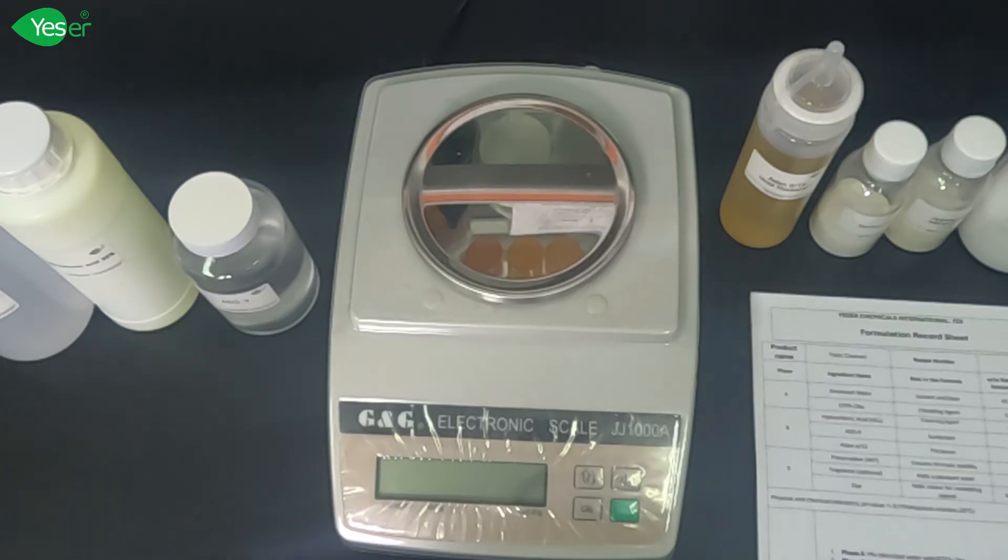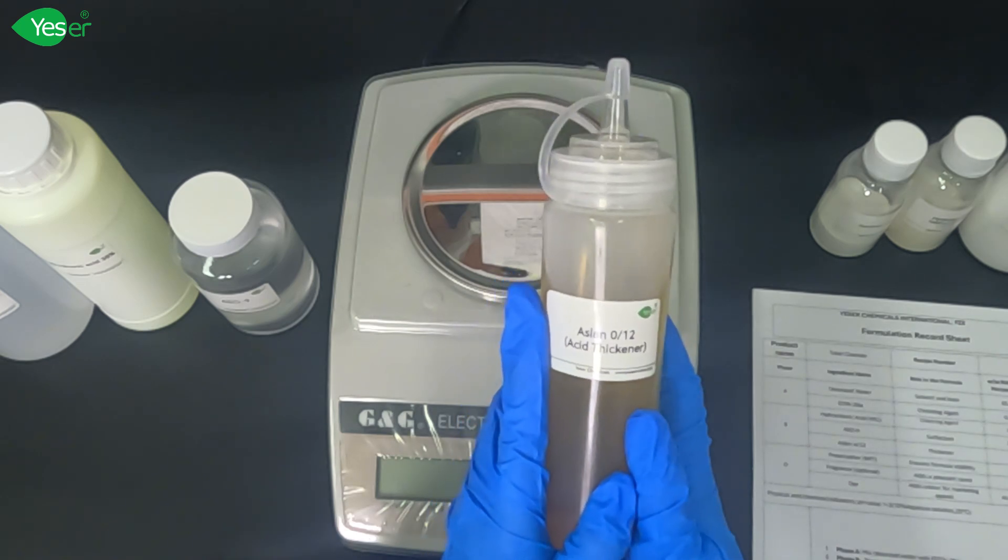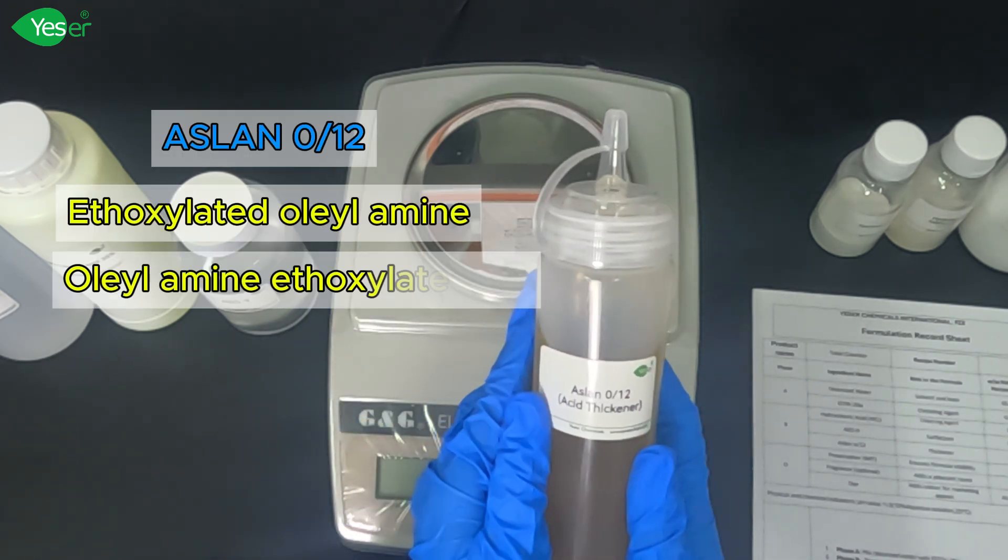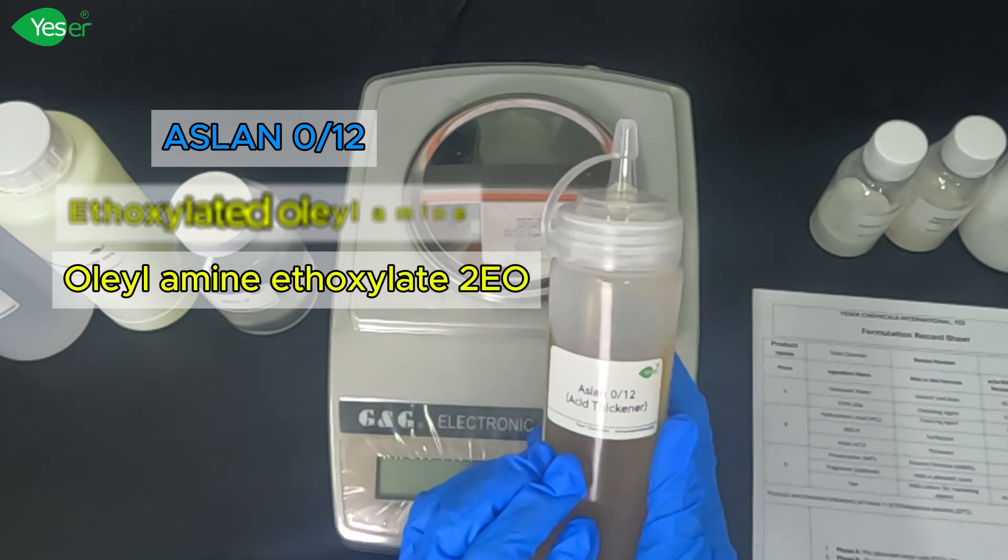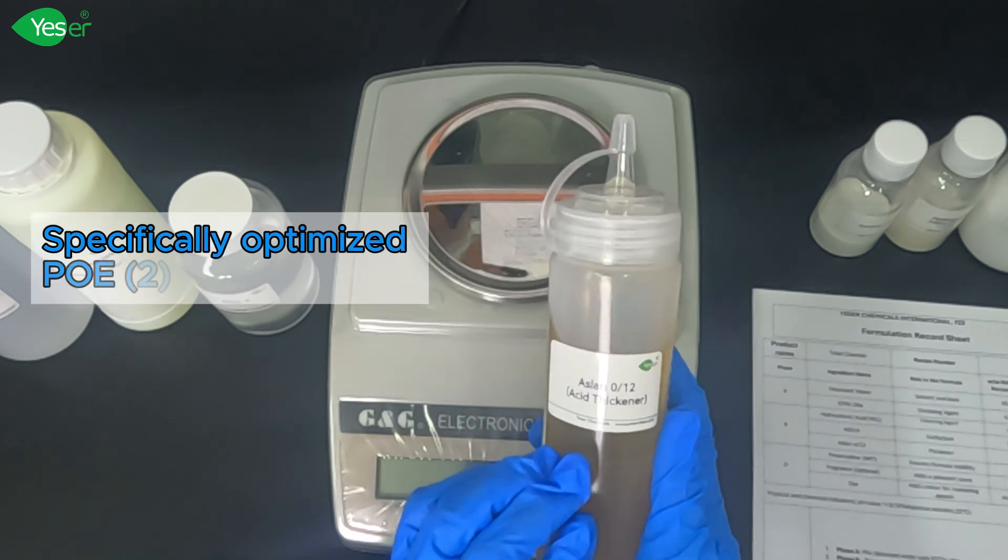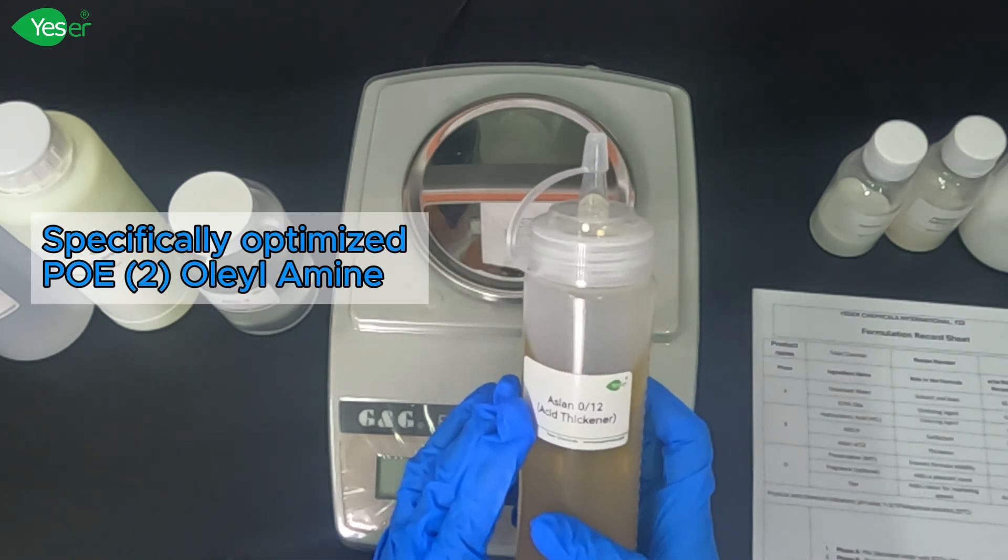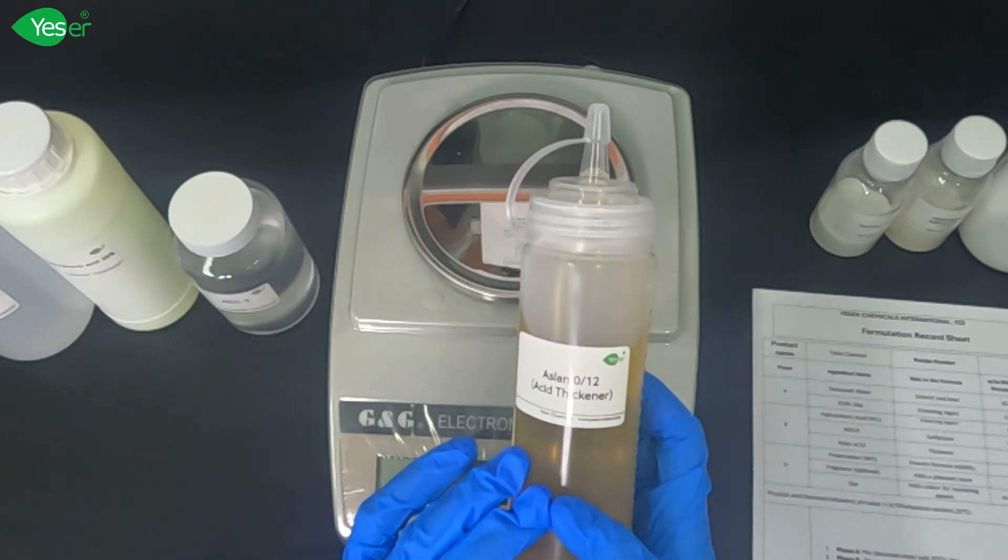We will have four different thickeners to compare their performance and efficiency in our acidic-based formulation. The first one is Aslan 012, also known as ethoxylated oleylamine, or oleylamine ethoxylate 2EO. This is a specifically optimized PoE2 oleylamine. It's a perfect thickening agent for many inorganic or organic acidic formulations, especially for strong acidic systems.